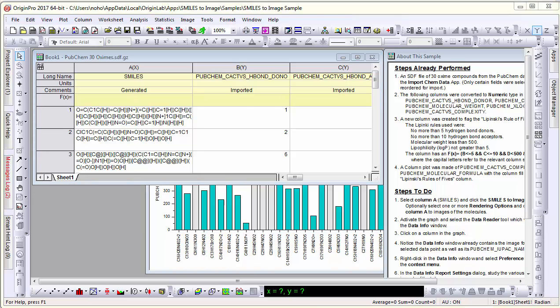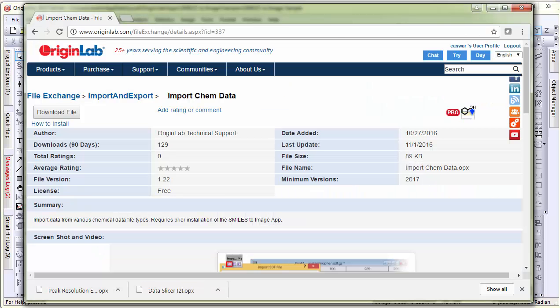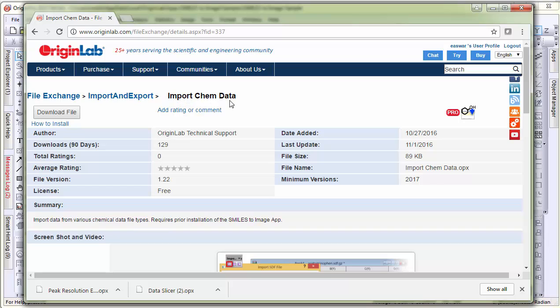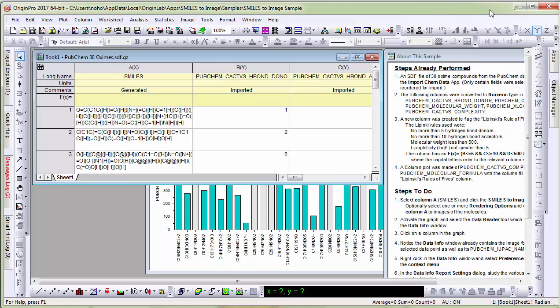There is a related app available from our file exchange apps website named ImportChemData. This app was used to import the data.